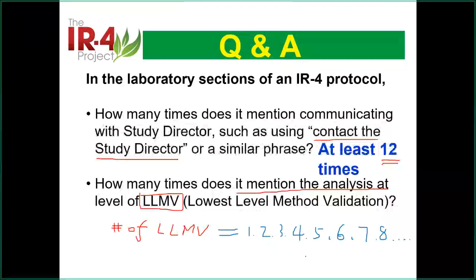Okay, I saw some questions there. What do you mean routine, non-routine maintenance? Okay. This is about the instrumentation. For example, let's use LC-MS, and we need to have a log to describe, to record all the activities.